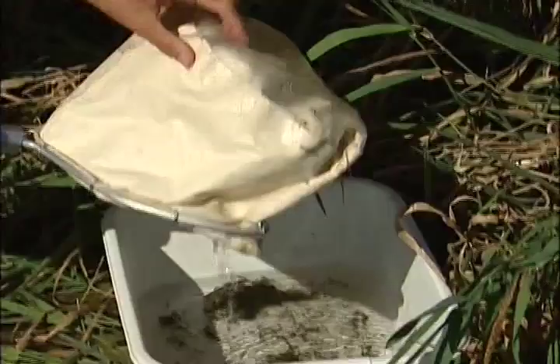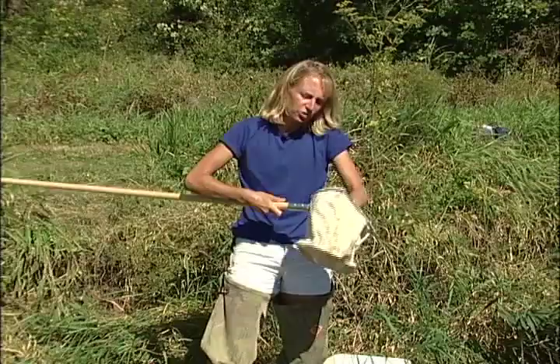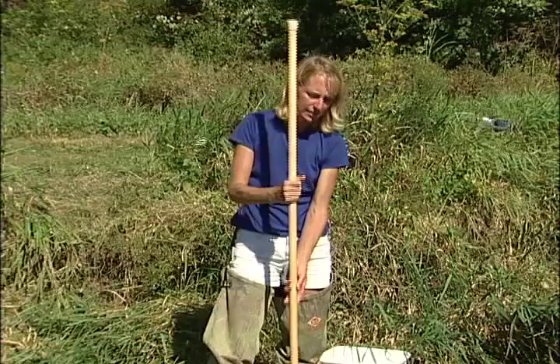Once you've done this, you'll move to the upstream end of the riffle, replace your net on the bottom, kick for two minutes once again or rub rocks, then pour the contents of the net into the dishpan.